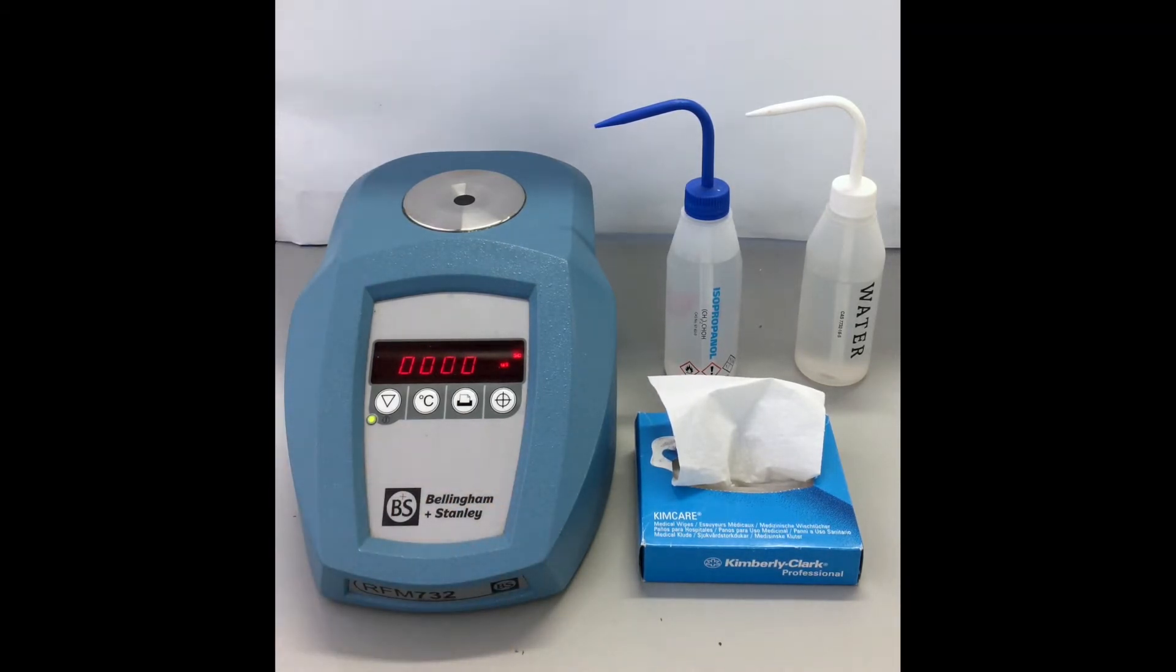The first key is the power/read key, used to switch the machine on and off and to take readings. This is the temperature key, used to display the prism temperature. And this is the print key. Press to send the reading to the linked printer.